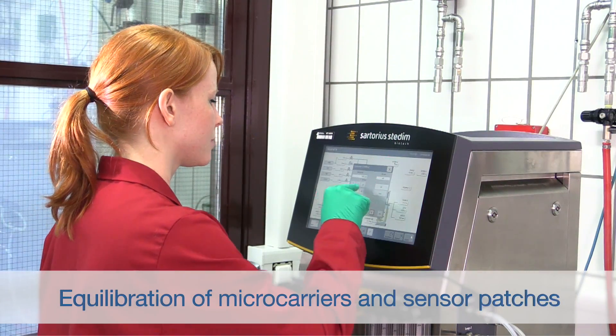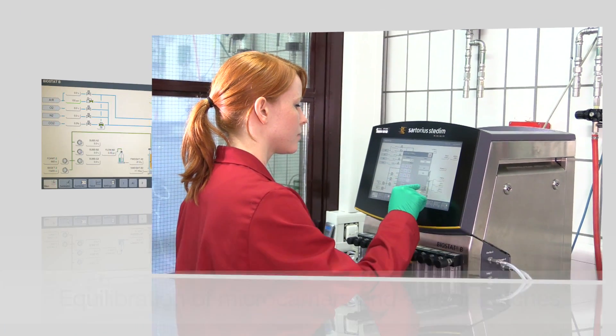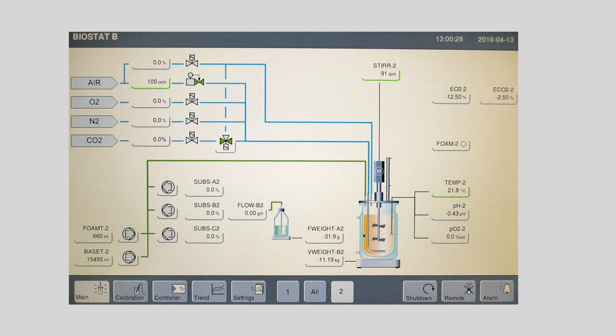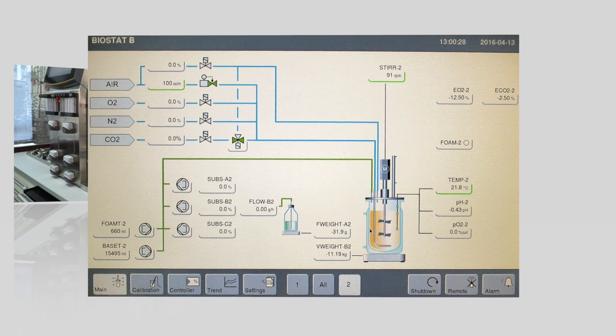Agitation, temperature regulation and headspace aeration are then switched on and set to 91 rpm, 37 degrees Celsius and 0.2 VVM respectively, which in our case means 100 mls per minute. In order to allow proper wetting of the sensor patches, equilibration must be performed for at least two hours. However, six to 12 hours is recommended.